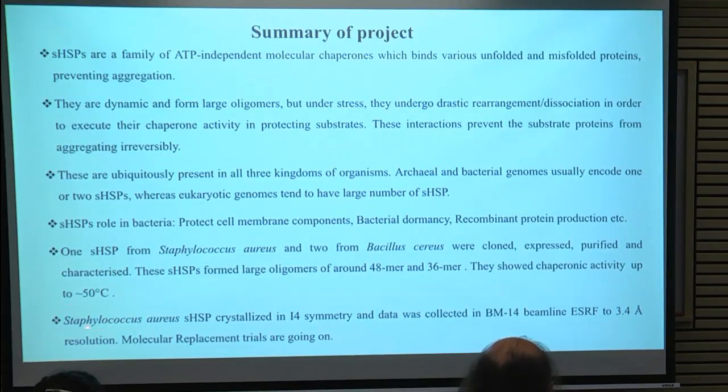Thus, I have crystallized the small heat shock protein from Staphylococcus aureus in I4 symmetry, and molecular replacement trials are still going on. Thank you.